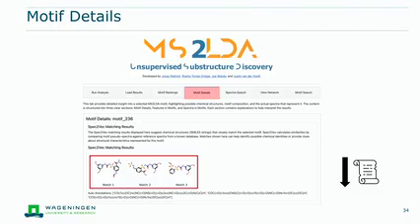Okay. If you really want to use it, I can really recommend spending some time on the installation, not with this bandwidth, but maybe later. We are obviously here at the conference during the entire time, so we can have a chat about it if you want any hints or whatsoever. You have the dataset, I hope. If not, then ask us, we can share it again and then explore it.